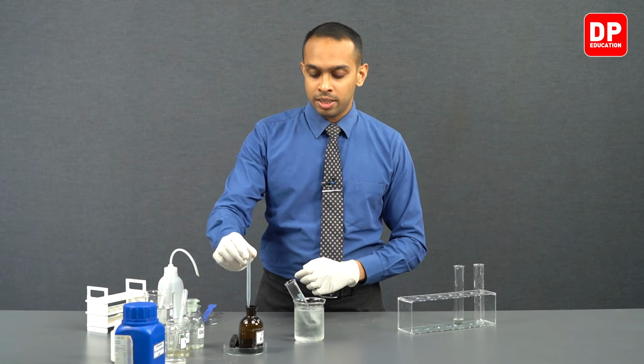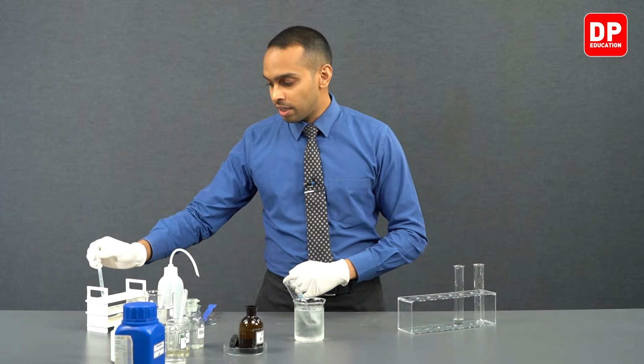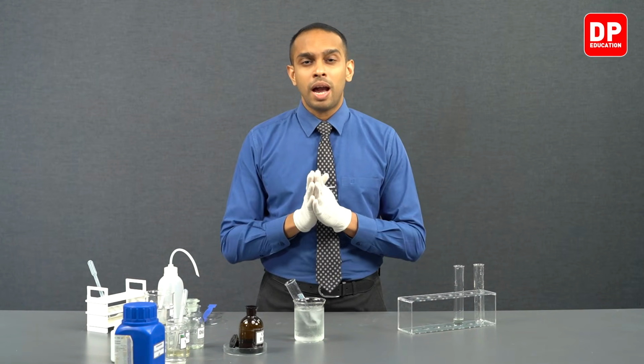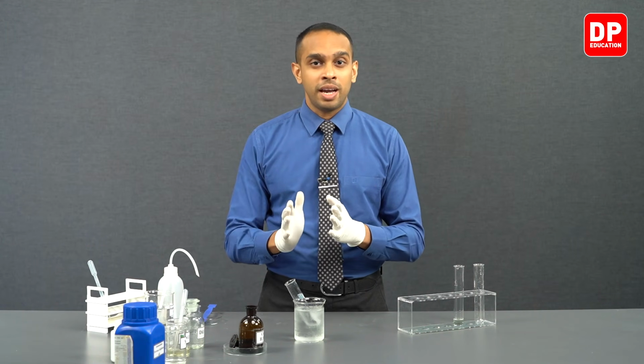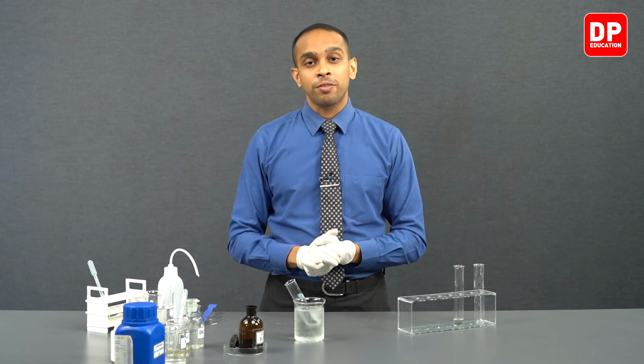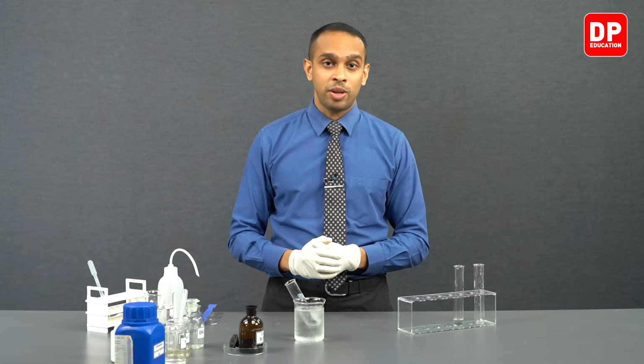Now students, when you are adding the concentrated sulfuric acid to this reaction mixture, you have to make sure that you add the sulfuric acid along the wall of the boiling tube that we have here. And you have to make sure to add a bit of a thick layer of sulfuric acid into this boiling tube. Otherwise, you will not very clearly observe the formation of the brown color ring that is getting formed.